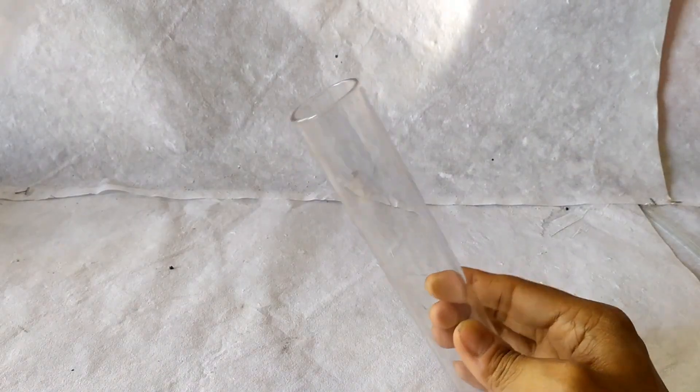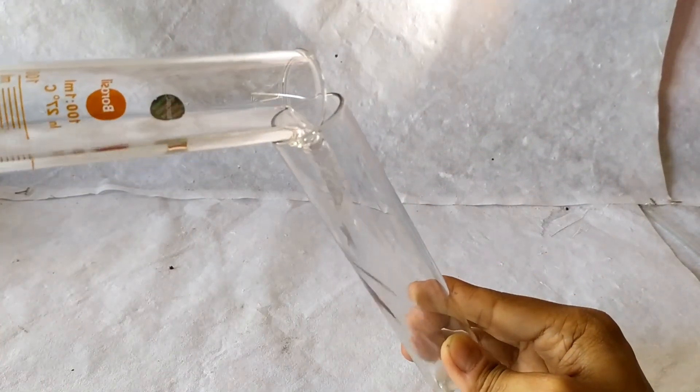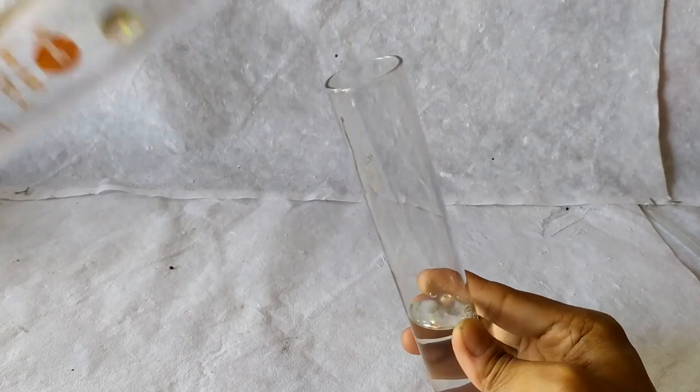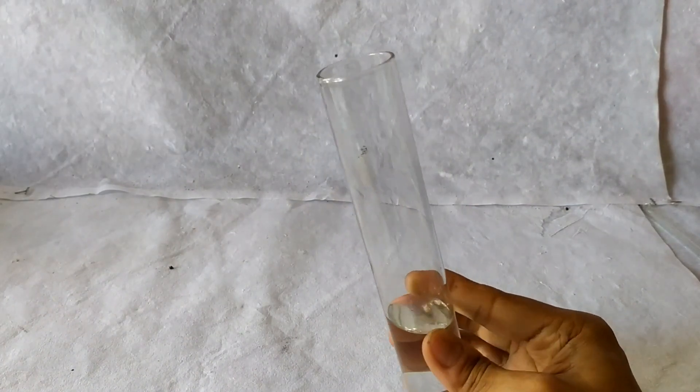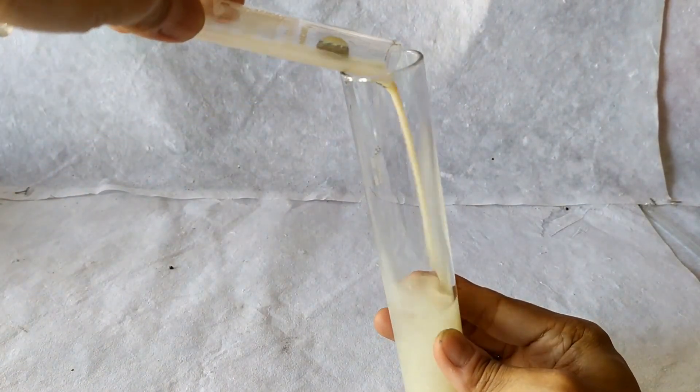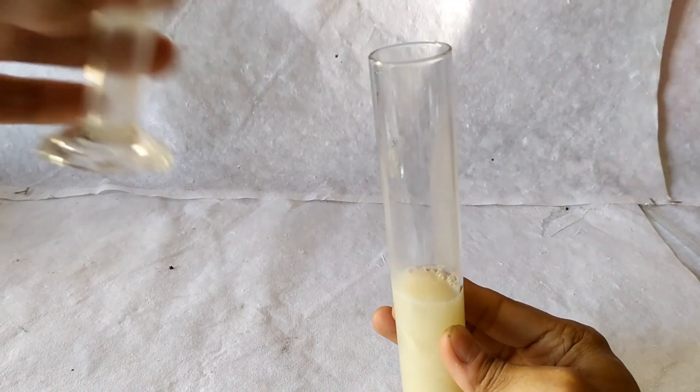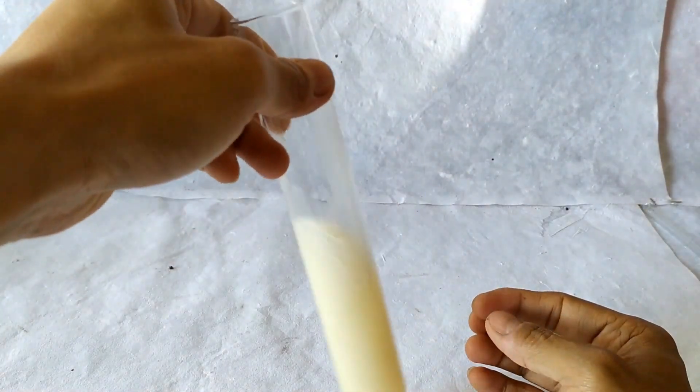Take the glucose solution and the yeast suspension in a 5 to 1 ratio in the large test tube. So if you're taking 50 ml of glucose solution for example, add 10 ml of yeast suspension to it.